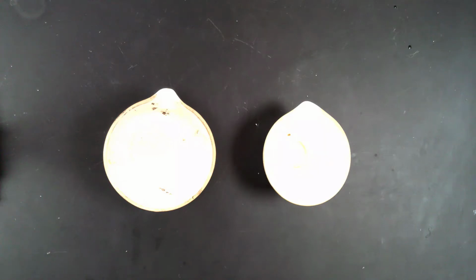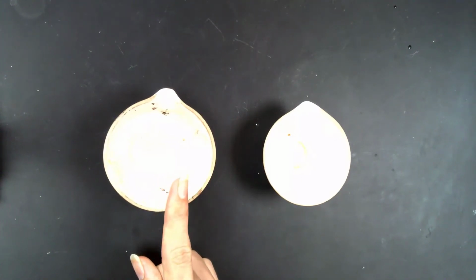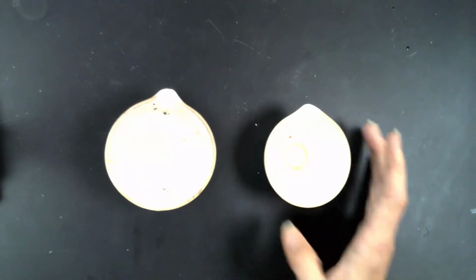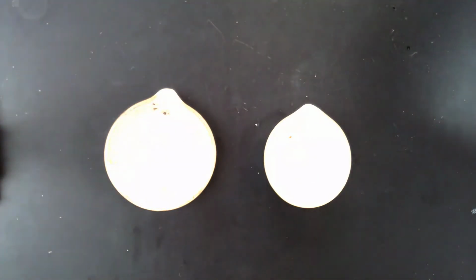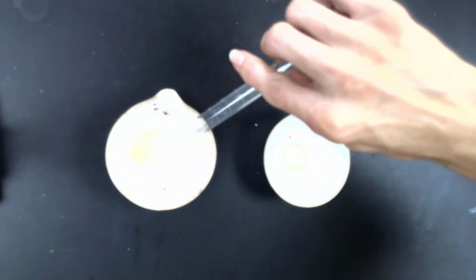So what I'm going to do is take just distilled water, and I'm going to pour it into this evaporating dish with my dry mixture. And then I'm just going to decant or pour off the salt water, and that will leave the sand behind, and I'll have my salt water in this dish right here. So the manual specifies 2 or 3 rinsings with 8 milliliter aliquots of distilled water. So I'm using the same red base graduated cylinder that I used for the density video, and I just measured out my first wash. So I'm going to go ahead and pour my water into the dish, like so.